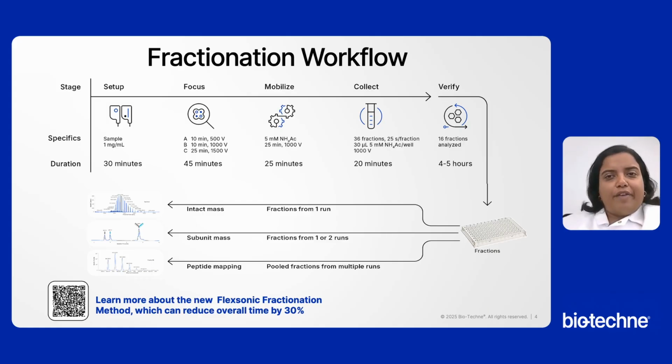Let's take a look at the fractionation workflow. We begin with injecting the sample, followed by the focusing step. After focusing, then there is a mobilization step to bring your peaks closer to the end of the capillary. And finally, collection of the samples.